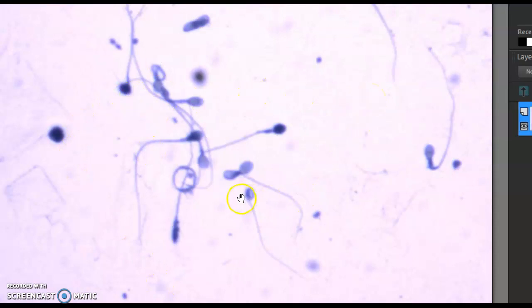And what's interesting is sometimes you see a little 2-headed sperm that's mutated. This guy, I don't think the tail's on wrong. I think it's just bent, but sometimes the tail is put on the wrong place. So it's sometimes interesting to see the sperm.